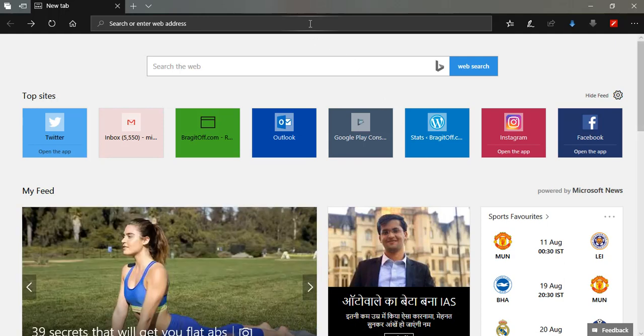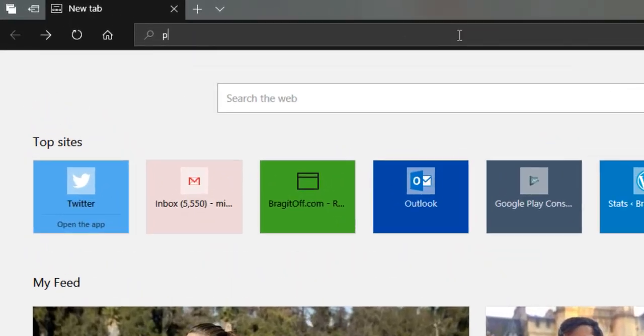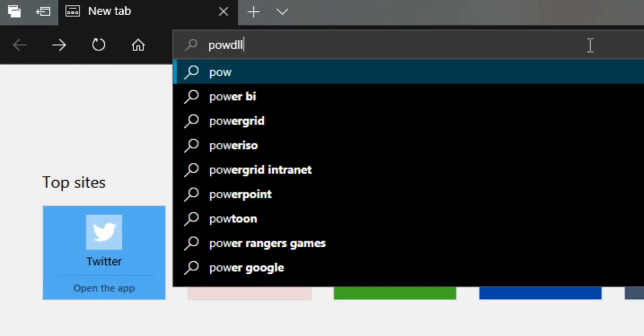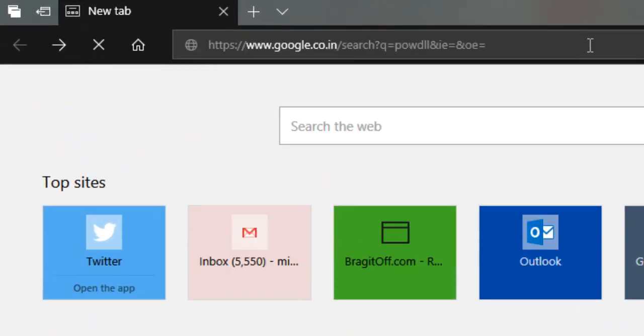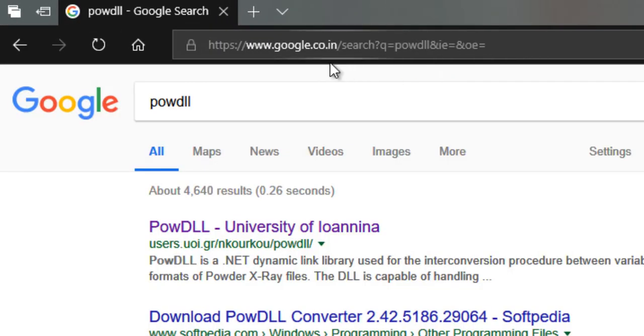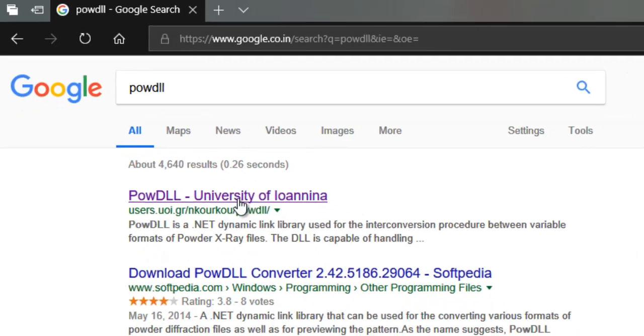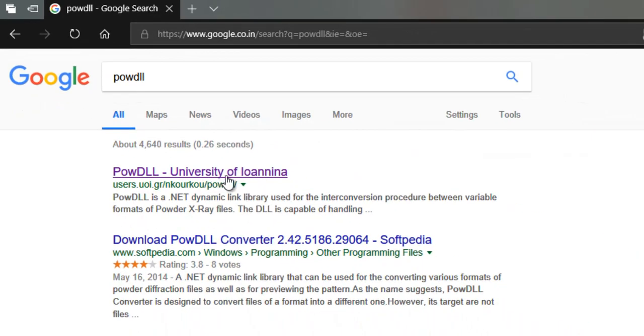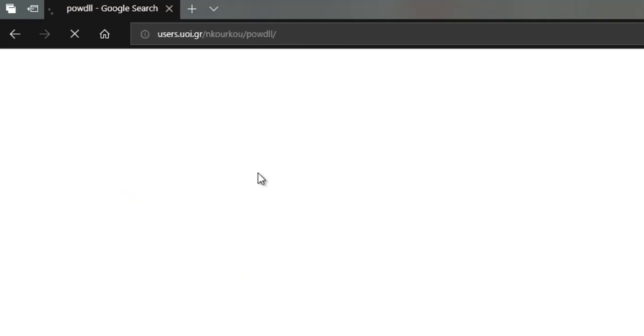So the software that we'll be using for this is called POWDLL. I'll just ask you to go ahead and Google for POWDLL. The first link that pops up is of University of... I don't know how to pronounce this so I'll just skip that.